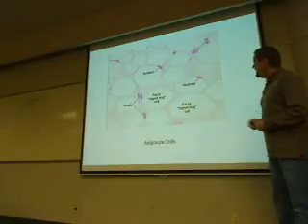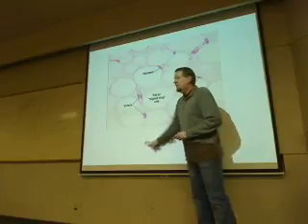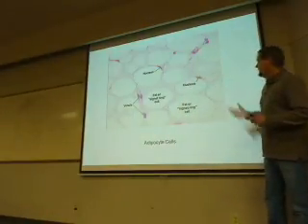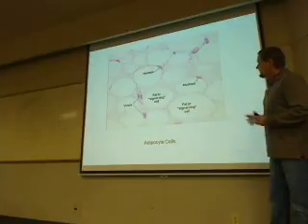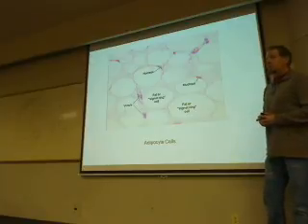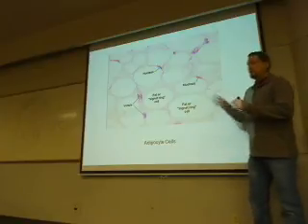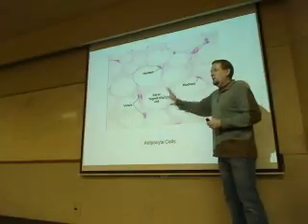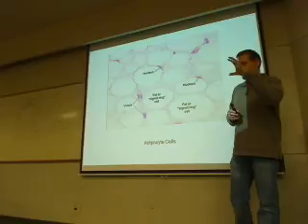This is an adipocyte. When we see "cyte," that means cell, and "adipo" is from adipose. So this is a cell that makes up your adipose tissue, or really bluntly, this is a fat cell, and this is fat. Once again, this is one of the few cells in a human being that's dominated by a vacuole. Remember, this is a cell, and cells are tiny. This vacuole is full of an oil droplet, just one little droplet occupying this entire cell.